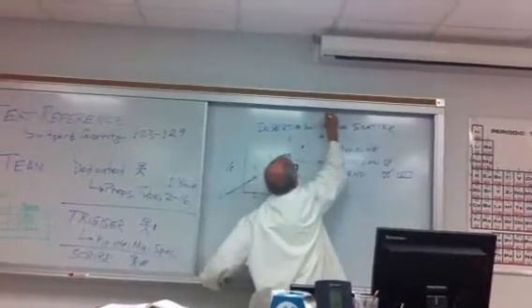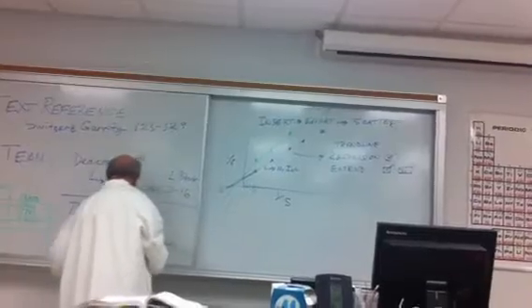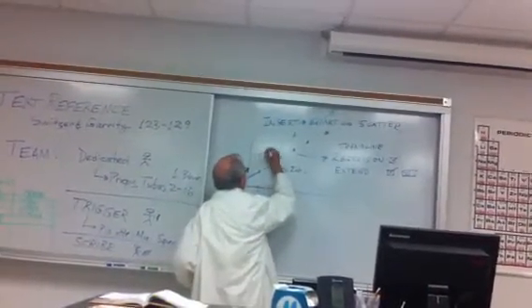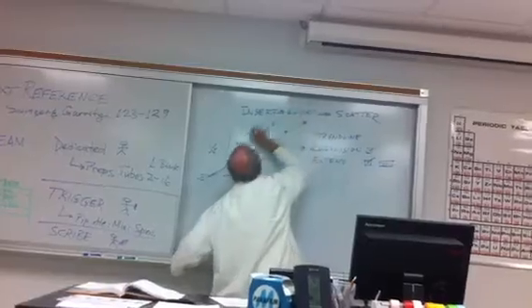You know, so it looks like that. And okay, and then you'll get a third. You'll get a third. Also, that'll be above your no inhibitor line. We don't know where it's going to be. Okay? And it's off over the ceiling.